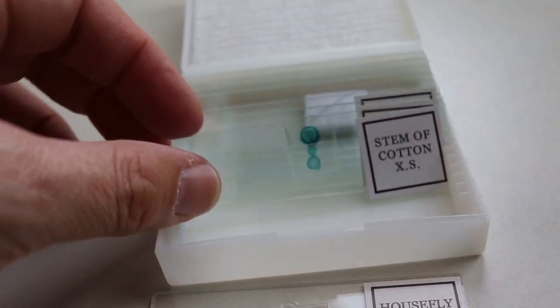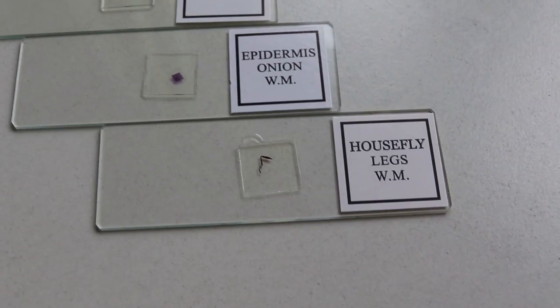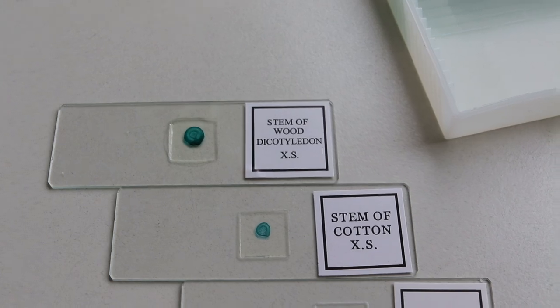So, yeah, I quickly had a look at these slides and they're professionally made. Okay, so they're actually microtomed, except the house fly legs, which is basically a whole mount. Yeah, they're stained and microtomed and I think they're quite good.